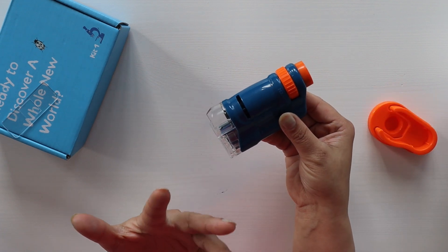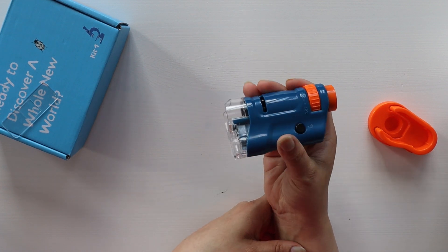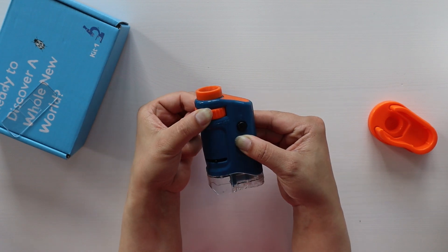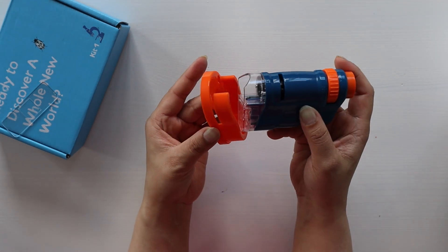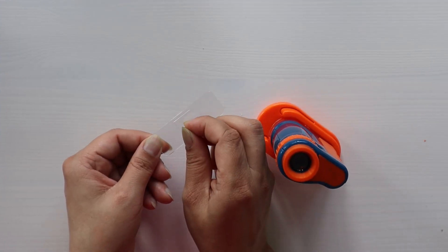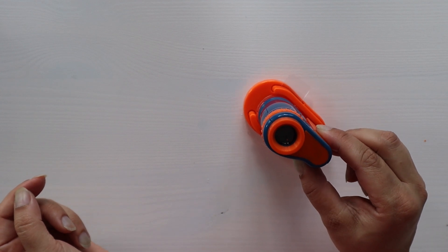If you are planning to explore outside, like different kinds of rocks, soil, or flowers, you can use it just like that. It has a light button — when you press it, it turns on the light. It also has a magnifying feature that you can adjust, and it's very easy to assemble. You just place it here and the portable microscope is ready.